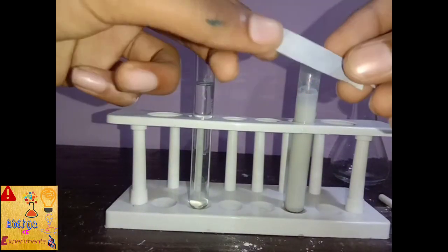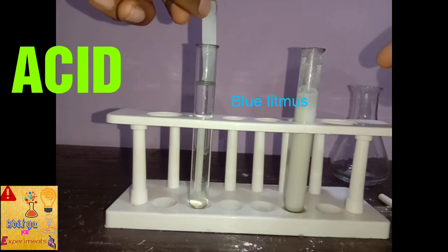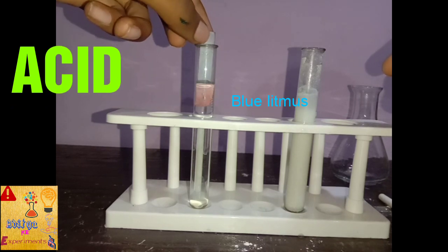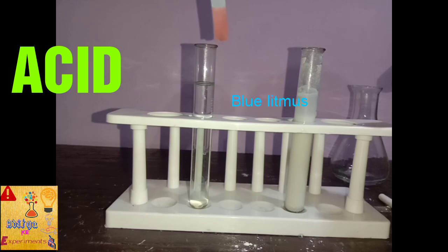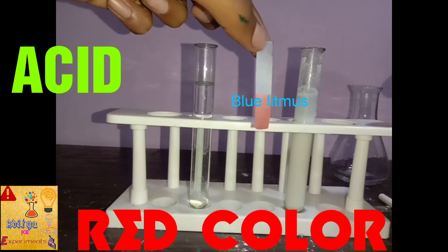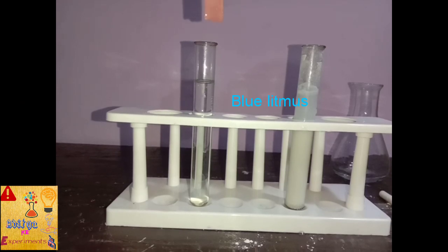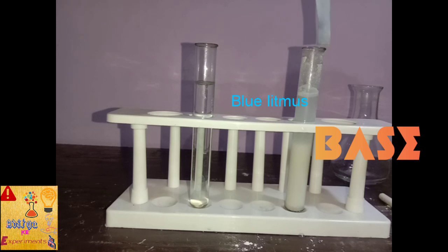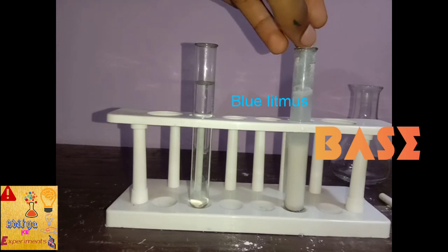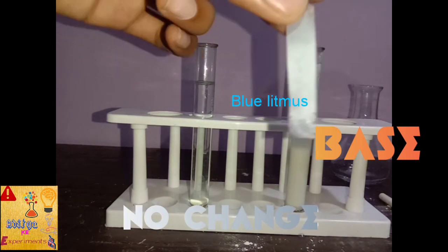Now we will check blue litmus paper in acid. So as you can see, blue color is changing into pink, or we can see it's changing into red color. Now we will check blue litmus in base. So here as you can see, no change.